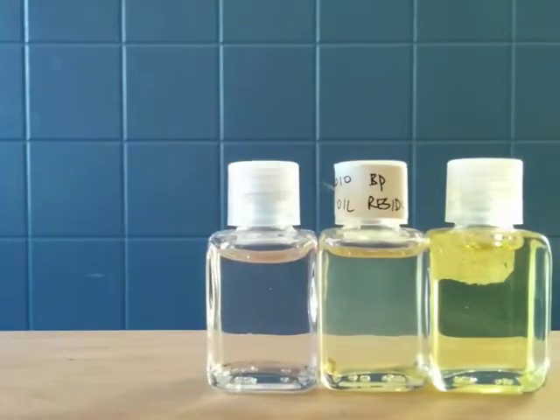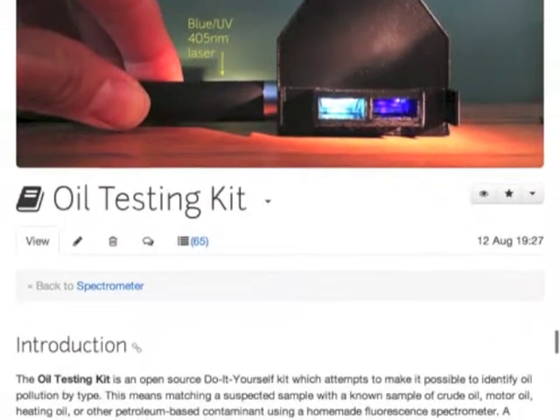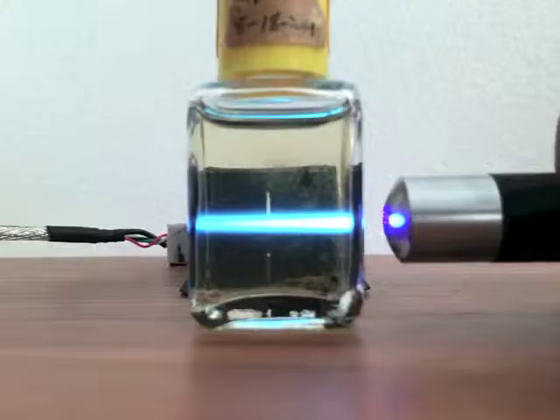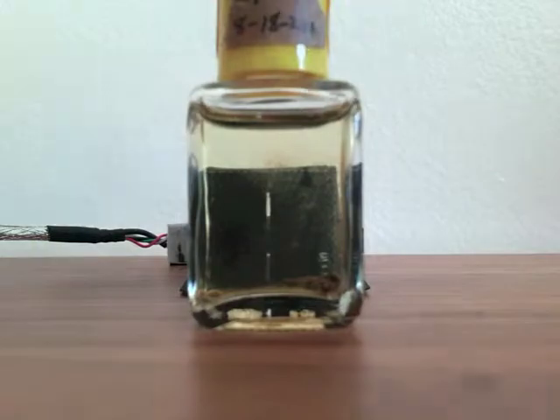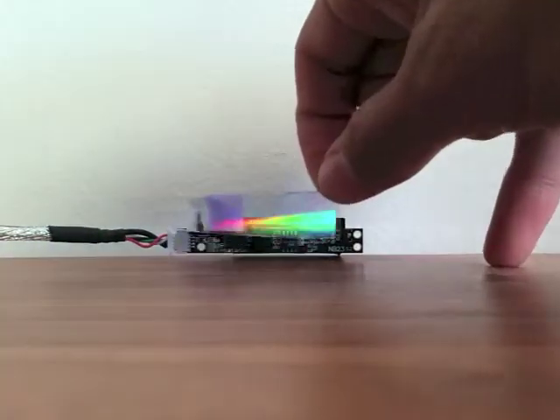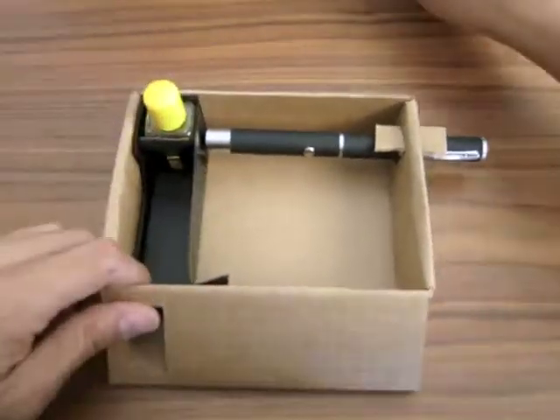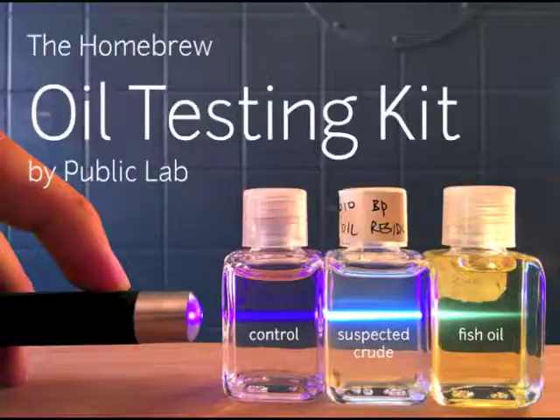We're designing the kit to be affordable, easy to use, yet precise. And of course, open source — so you can download the plans and build one yourself today. It uses a UV laser, a narrow slit to let a beam of light in, a piece of DVD to diffract the beam, and a webcam. These parts fit into a carefully sized cardboard frame. There's a lot left to do, and if we all work together, we can make affordable pollution detection a reality.